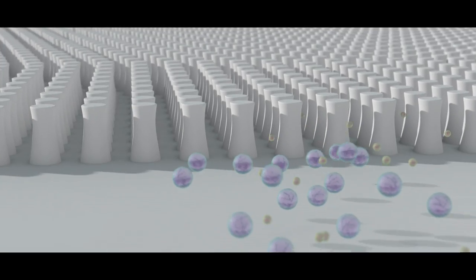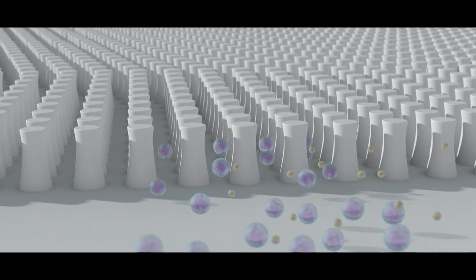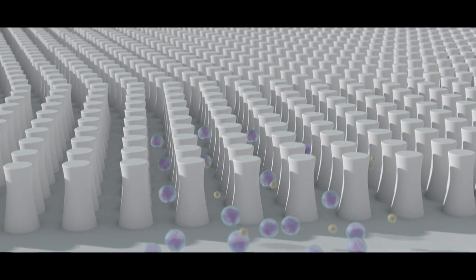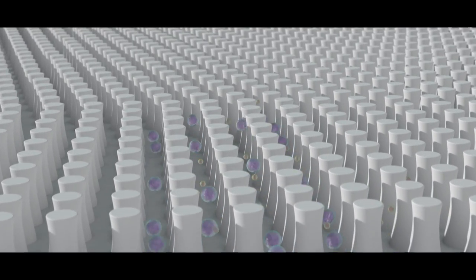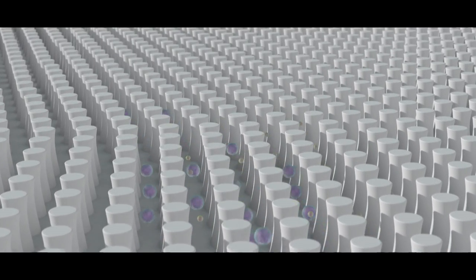Exosomes enter the NanoDLD pillar array and are split into separate streams according to size.